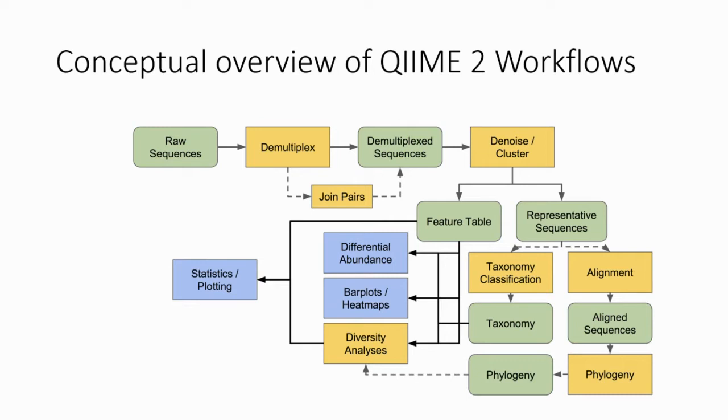You can see the file name, fastq.gz. Normally you will not be opening it. You cannot just click it and open the file. So today we will go through this process to see how we can read the file, understand the file, and analyze the file.